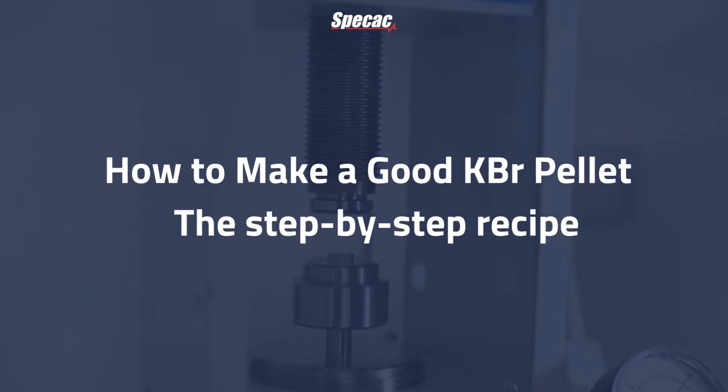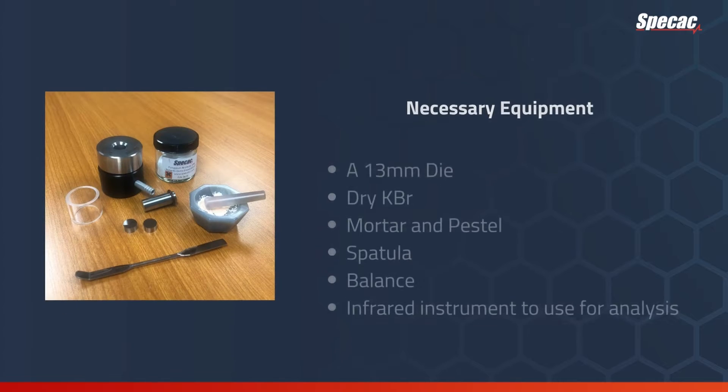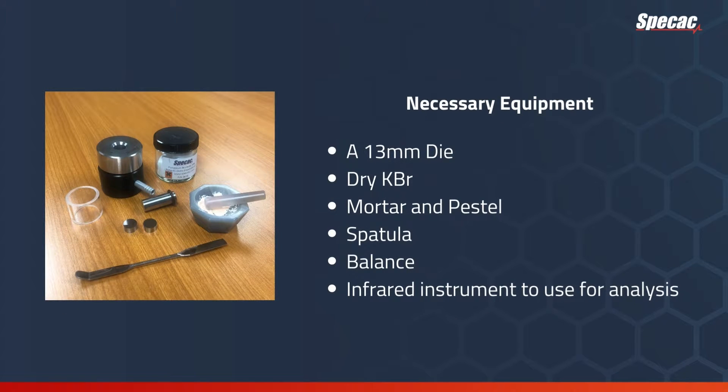How to make a good KBR pellet: a step-by-step recipe from Specac. To make a good KBR pellet you will need a 13mm die, dry KBR, mortar and pestle, spatula, balance, and of course the infrared instrument to use for analysis.